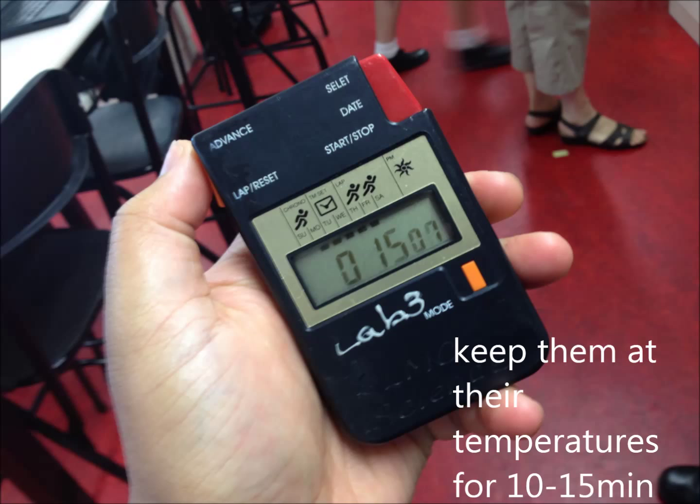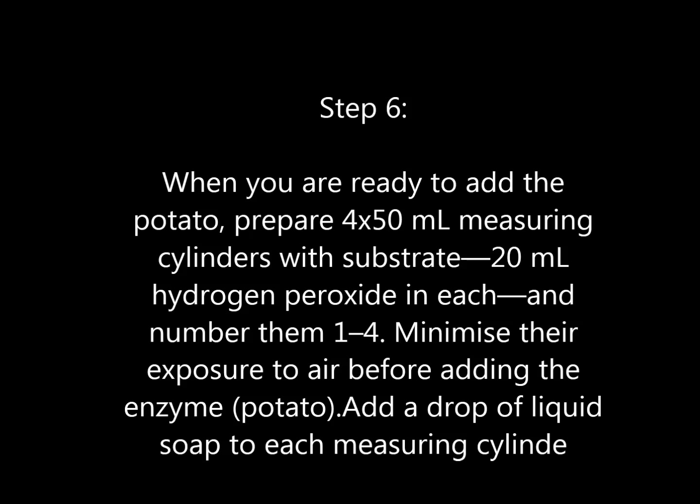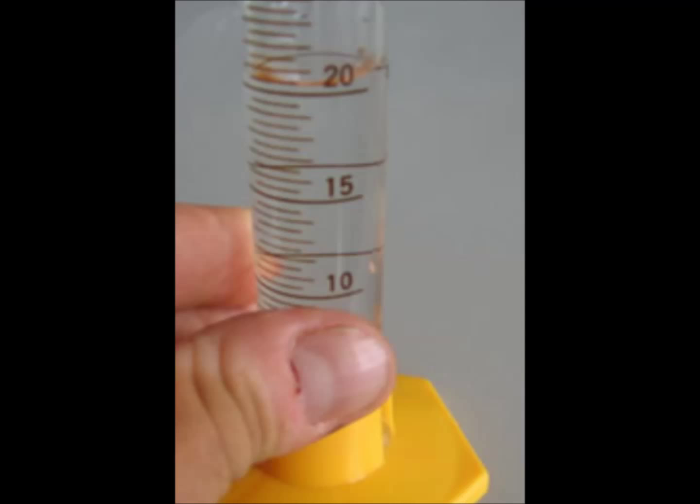Step 6. When you are ready to add the potato, prepare four 50 milliliter measuring cylinders with substrate — 20 milliliters of hydrogen peroxide in each — and number them one to four.